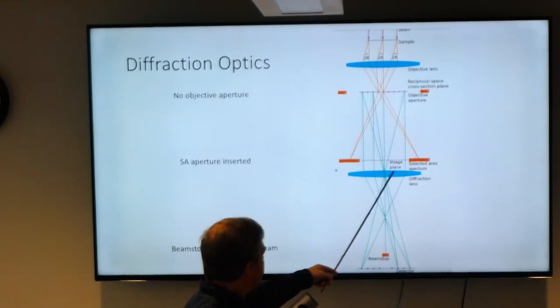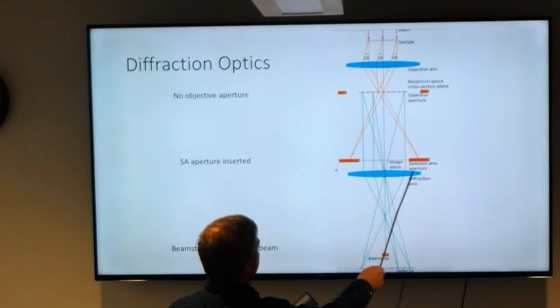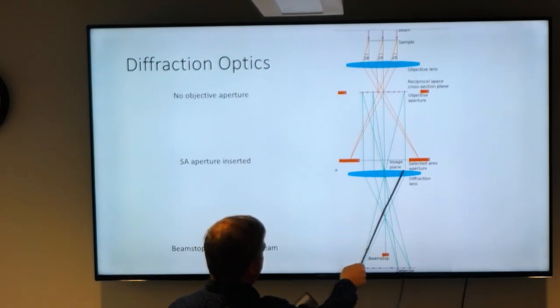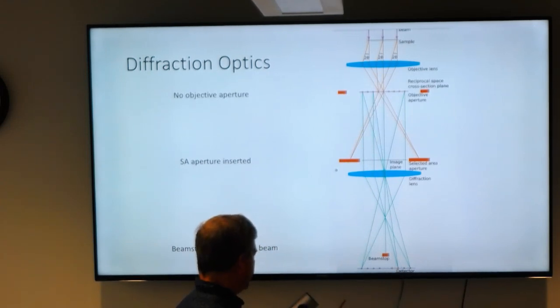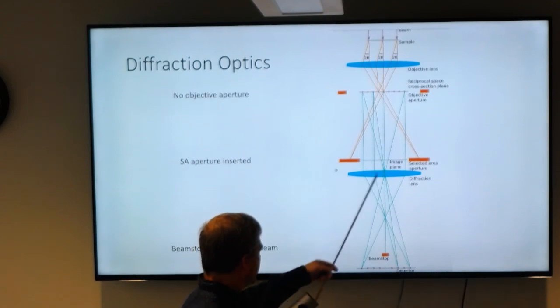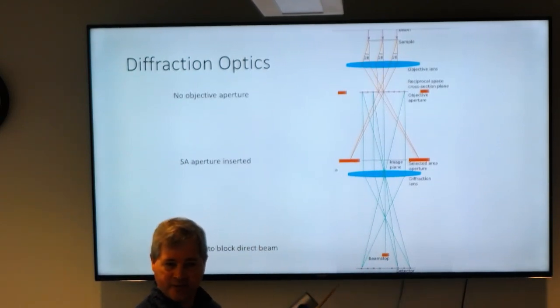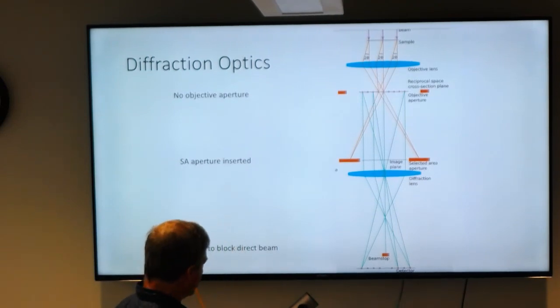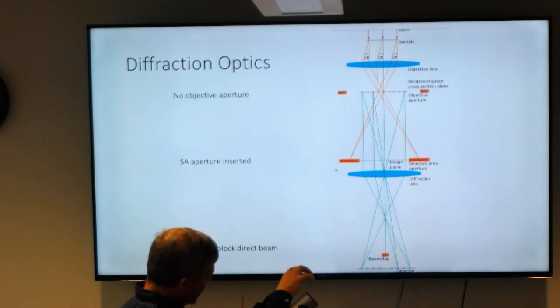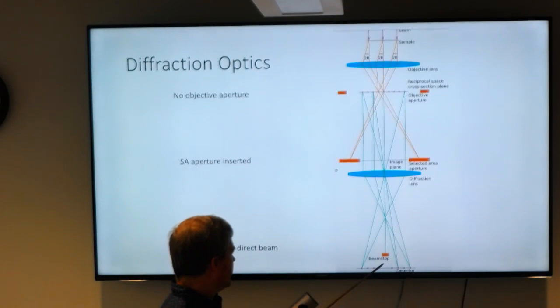With a diffraction lens, it sort of magnifies one of the crossover points, so that instead of the real space image hitting the detector, what you get is an image of the diffraction pattern hitting the detector. So you can collect the spots directly, assuming the scope is set up right and everything is focused right. You do have to make sure the diffraction focus is right, so that you will actually get a finely focused diffraction pattern on the detector.